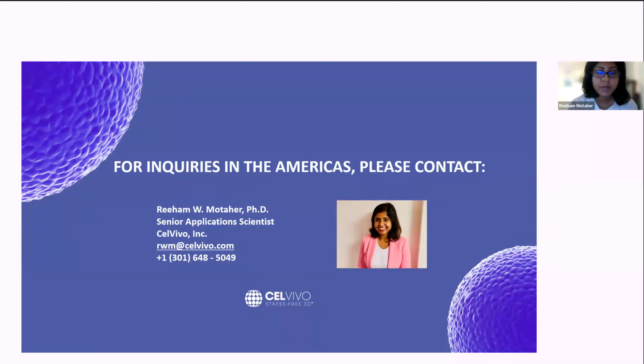So the first question that came in, Krzysztof, is, can I grow patient biopsy samples, tissue samples, and primary cells in the clinostat? I would say "grow" is a very important word, because if we think about tissue biopsies, we usually think about keeping them.